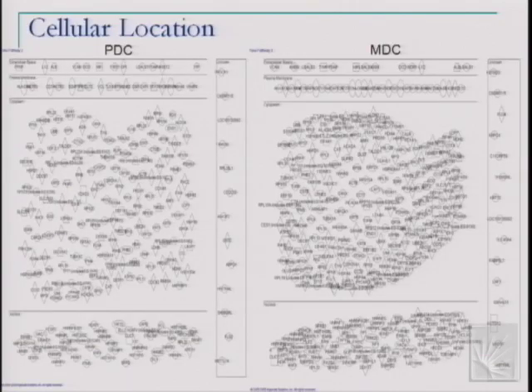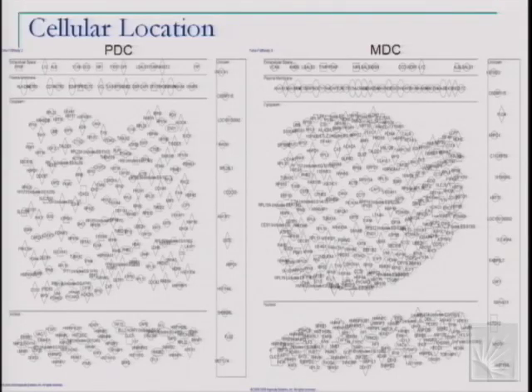There were some questions in the beginning of how well we were lysing the cells with our protocol. So we used the cellular location function in the pathways software tools that we have in IPA, to just see the distribution of proteins that we identified and where they're located in their cellular compartment. And we can see that we're getting a pretty good representation in the plasma membrane, to be expected of what you typically get when you do just a straight up lysis, as well as nice distributions across other regions. So it was encouraging that we felt like we were lysing effectively.